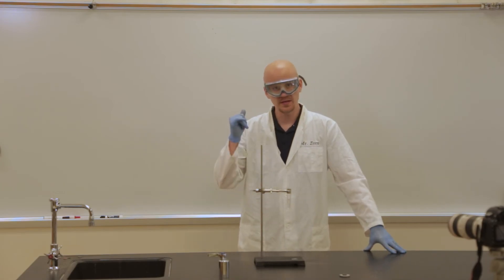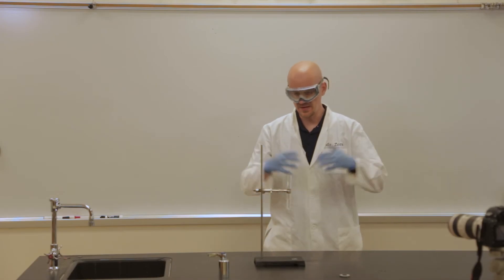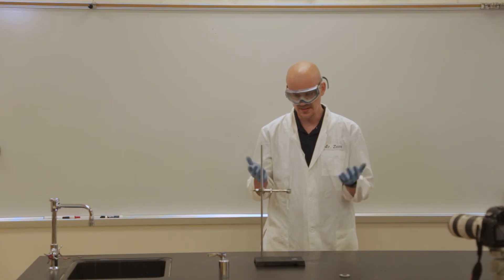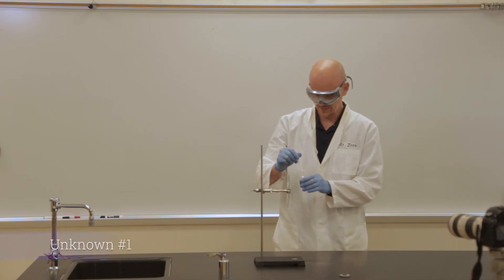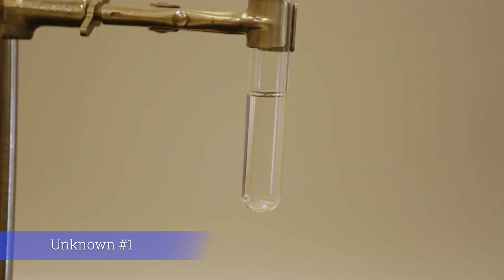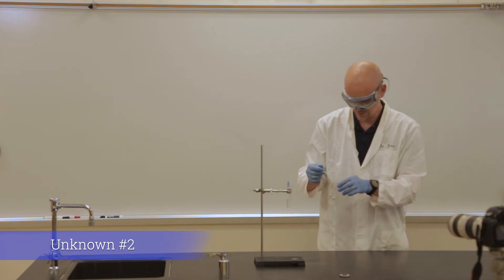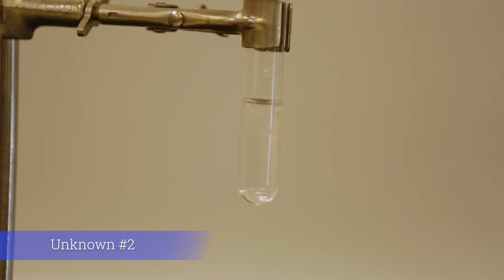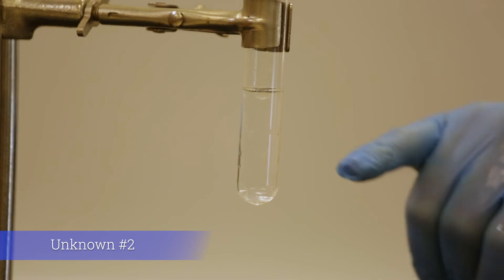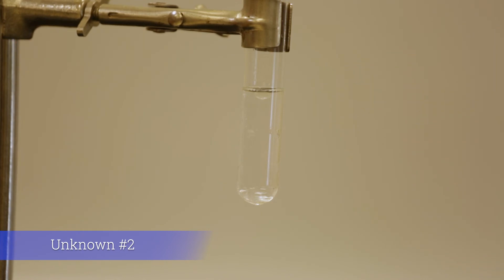For our next test, we are going to test solubility in both water and vegetable oil. I have a test tube and I'm going to add a couple drops of each unknown. We're going to look and see if it mixes together or if we end up with layers — if it has layers, it's insoluble. The first unknown looks like it has combined with the water. For the third unknown, after squirting it in, it looks like it's rising to the top — you can definitely see a difference in layers — so I would say this is insoluble.